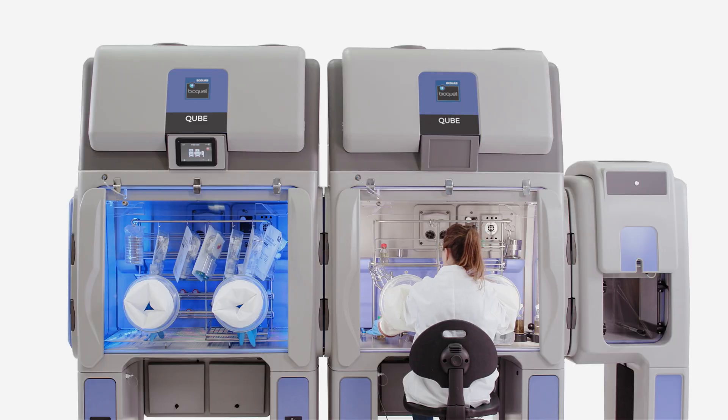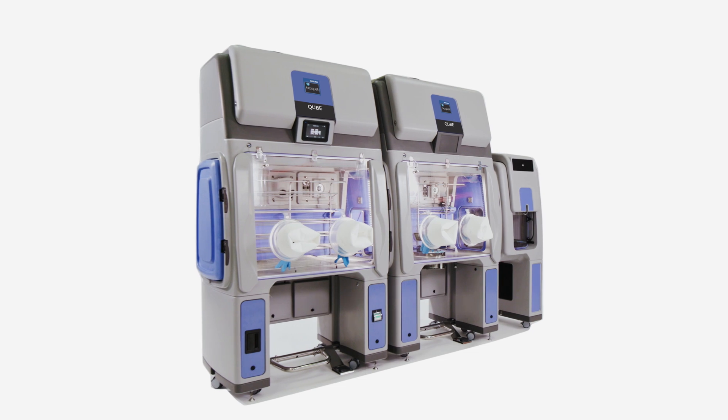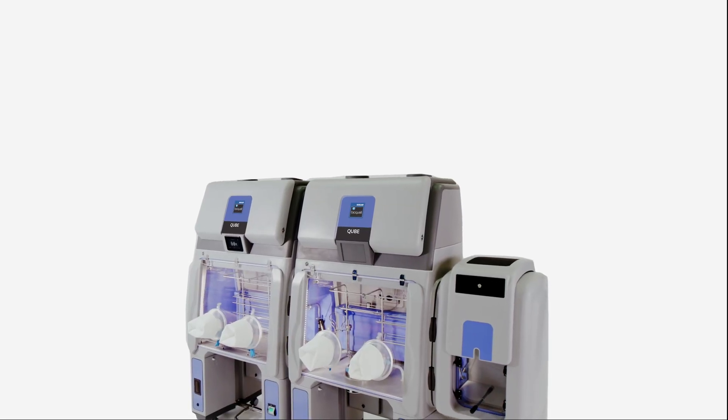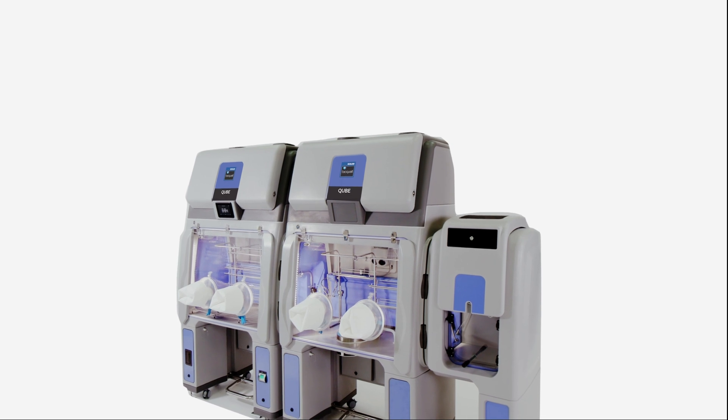Compared to stainless steel, the BioQuell Cube weighs significantly less and offers greater maneuverability. Combining these benefits with its small footprint allows any configuration to fit through most doorways and only requires a standard outlet to function.